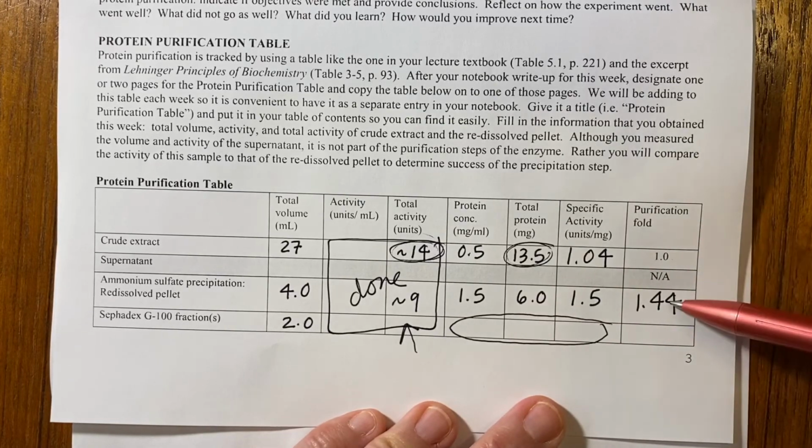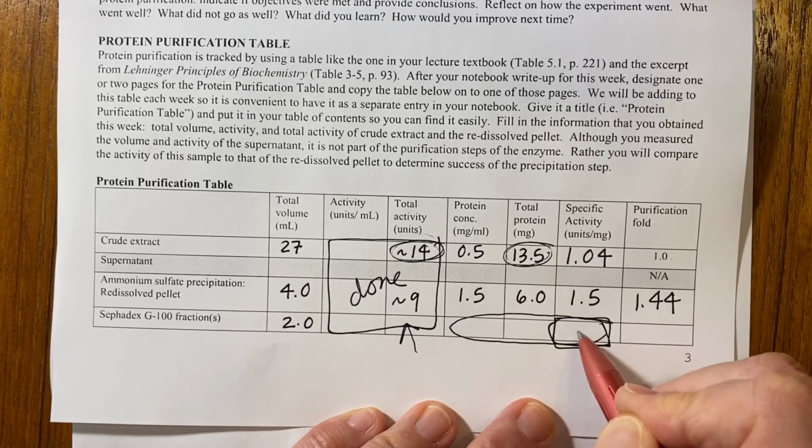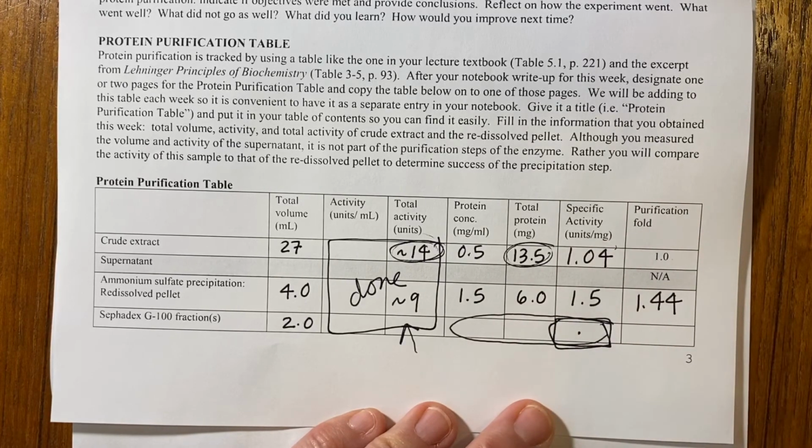So that's the purification fold. Then when you get this number, whatever this is, you divide it by this number and write that number in here. Then if your purification was successful, these numbers should increase. So 1 to 1.44 is good. And if this number is larger than 1.44, then your purification was successful.